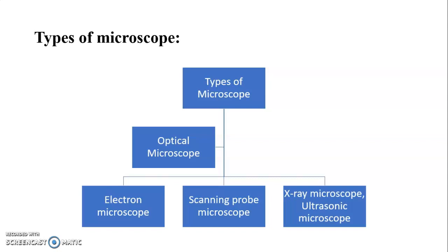Deviation of the incident light beam from the illuminator into the objective lens is done by a plain glass reflector inclined at a 45-degree angle to the axis of the incoming light from the source. The light incident upon the specimen is reflected back from the specimen surface and passes through the objective lens and glass reflector to form the final image. The enlarged image of the bright area of the specimen surface can be observed through the eyepiece.